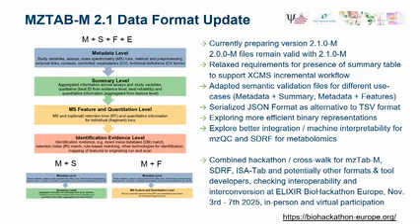So we are currently in the process of updating the format. We found out in the past few years, when using it with some of the different implementations, that we need more flexibility concerning the number of levels that we can report on, to also allow to include this, for example, in XCMS workflows to successively build up the information from basic information, for example, starting at the feature level, then adding the metadata and summary level information later, and then complementing that with the identification evidence.